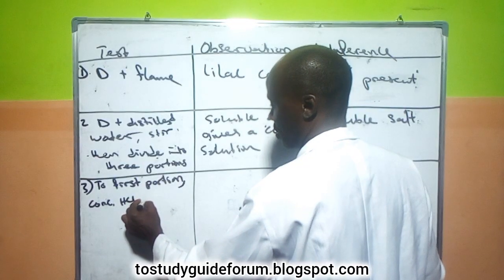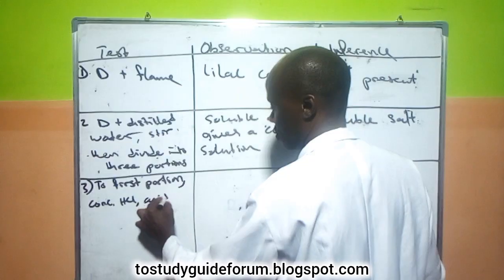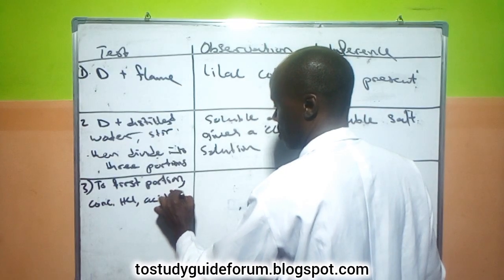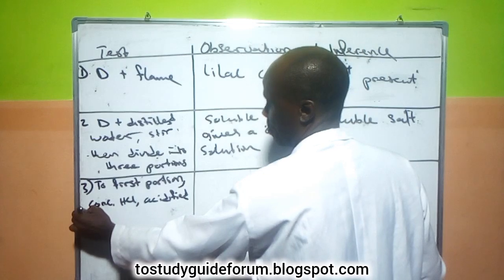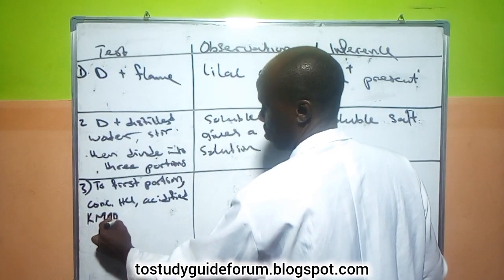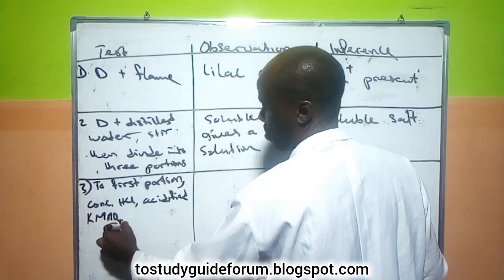Then we have acidified potassium permanganate.